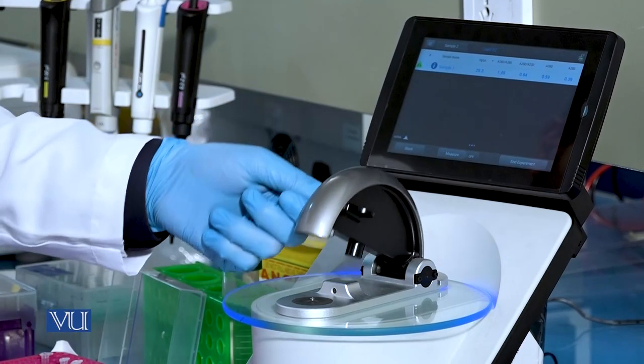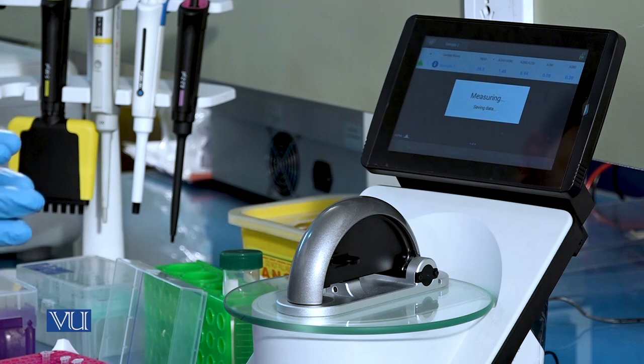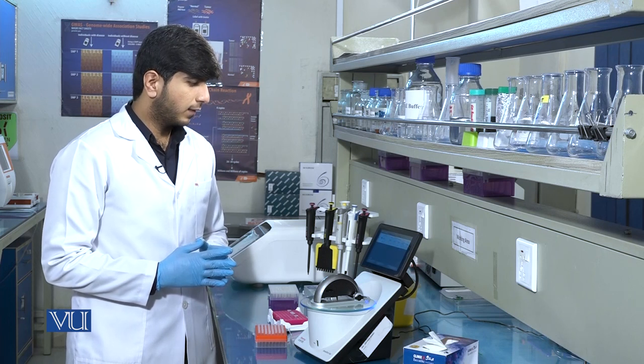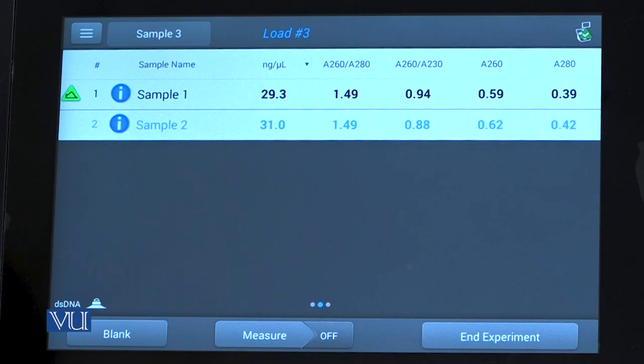After pouring the sample, we will close the paddle and click on measure. The Nanodrop instrument will measure the concentration of DNA. And here you can see that in sample 2, the concentration of DNA is 31 nanogram per microliter, and the purity of the DNA is again 1.49, which is the A260/280 ratio. And these are the other ratios which show the presence of contamination in the sample.